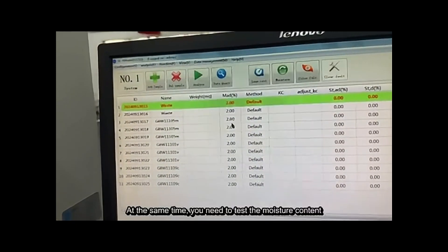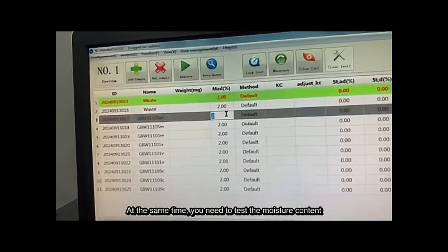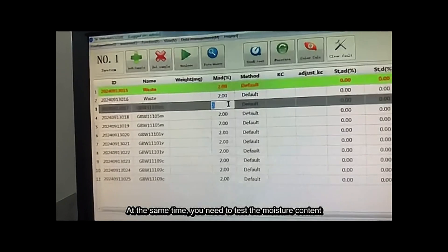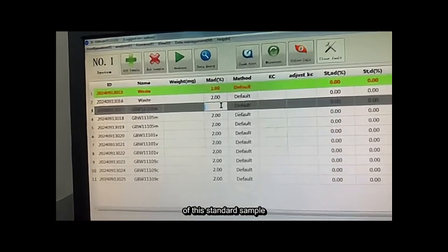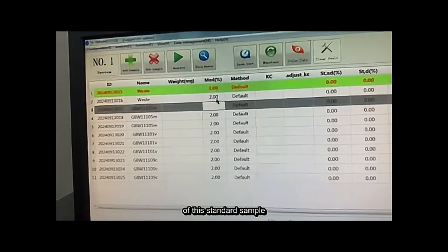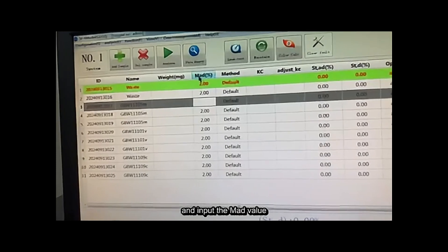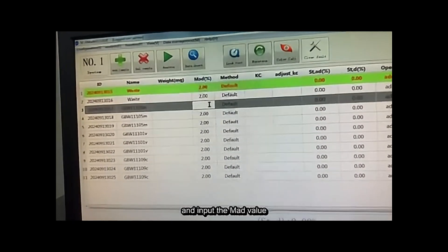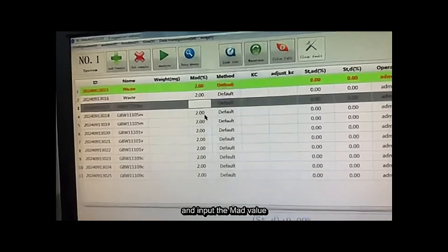At the same time, you need to test the moisture content of this standard sample and input the moisture — MAD.